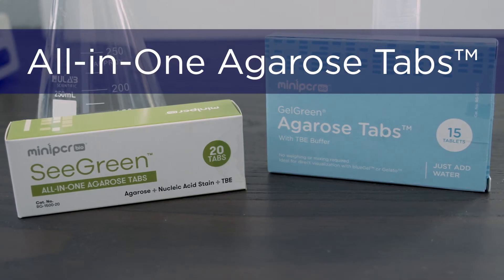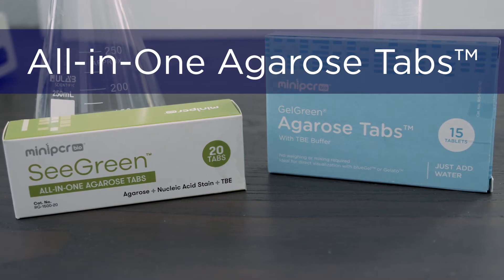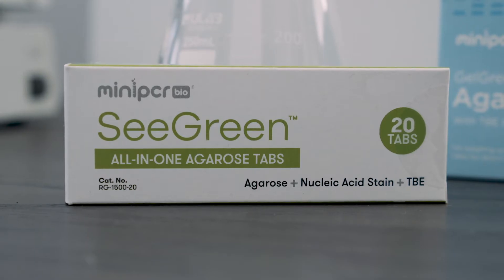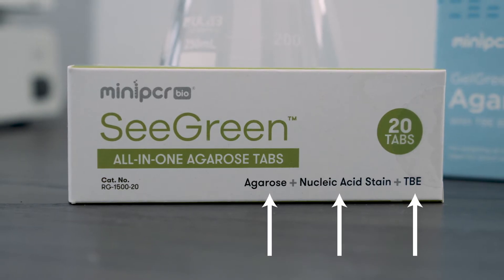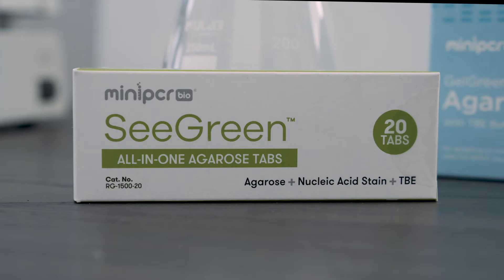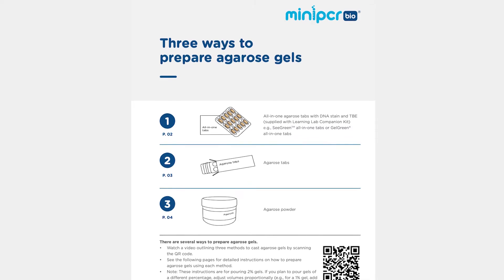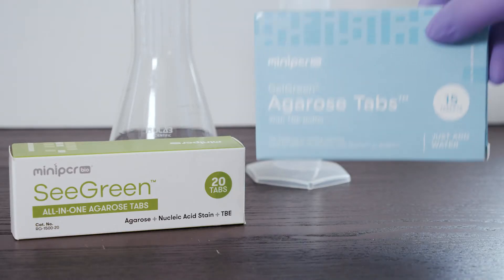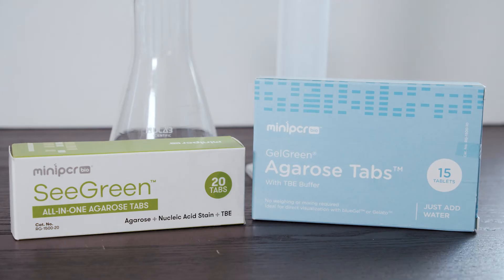All-in-one agarose tabs like sea green and gel green agarose tabs are the simplest and fastest way to pour gels. Each tab includes the agarose, buffer, and DNA stain needed for one 2% agarose gel, but these instructions can be adapted for any gel percentages. Sea green tabs contain sea green stain, while gel green tabs contain gel green stain. Both detect DNA safely and clearly in any electrophoresis system with a blue light illuminator.